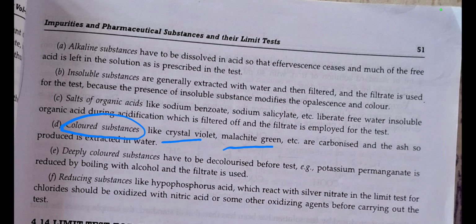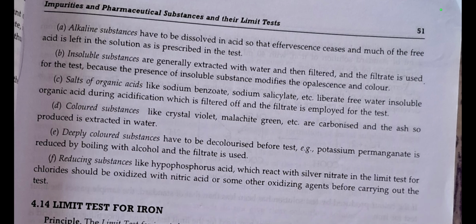For deeply colored substances like potassium permanganate, which we already performed in class, we first treat with ethanol or alcohol, heat it and filter. The potassium permanganate gets reduced to manganese dioxide, so the colored solution is converted into a colorless one on heating with ethanol. After that, the colorless filtrate is used for the test.